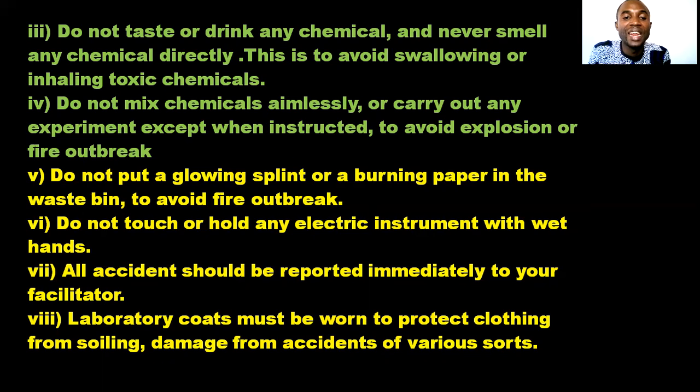Now, do not put any glowing splint or burning paper in the waste bin, to avoid fire breakout. Do not touch or hold any electric instrument with wet hands, because you will have an electric shock. All accidents should be reported immediately to your facilitator, your teacher or your instructor.